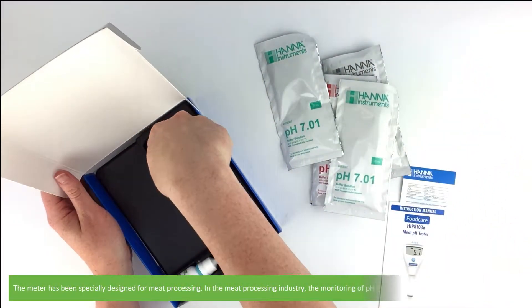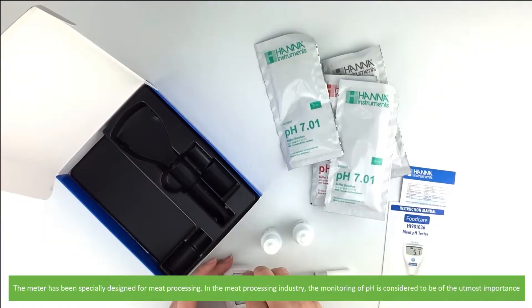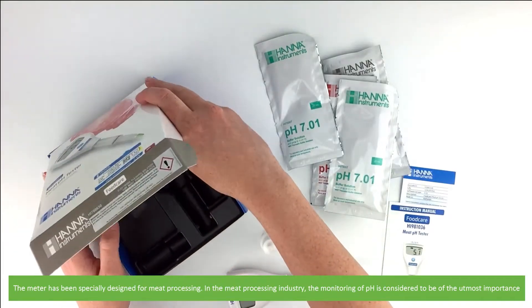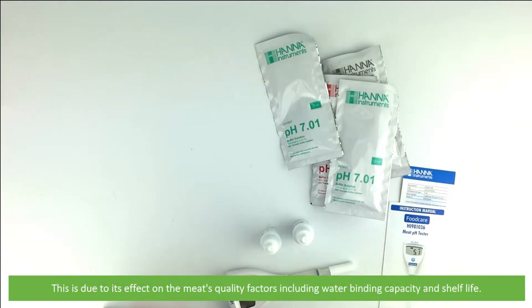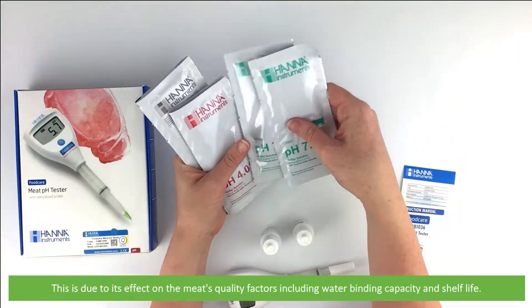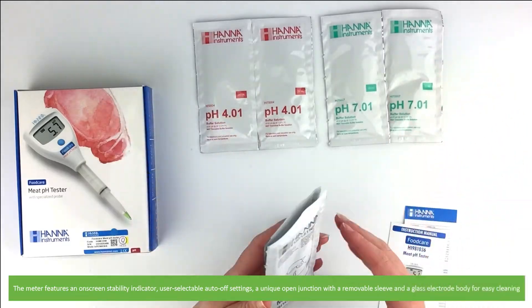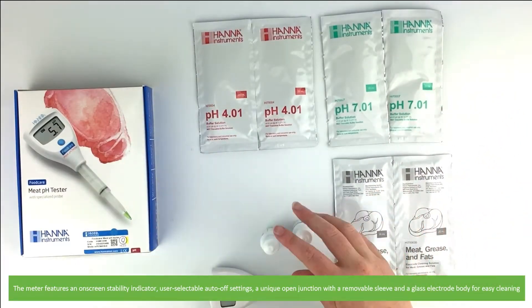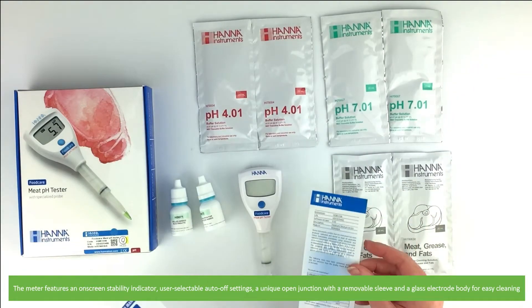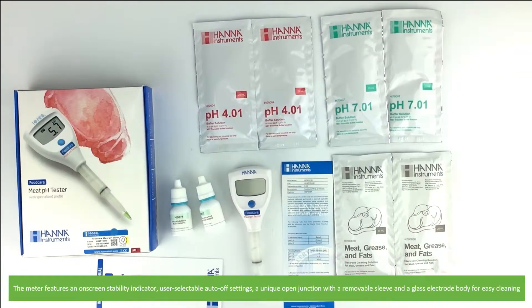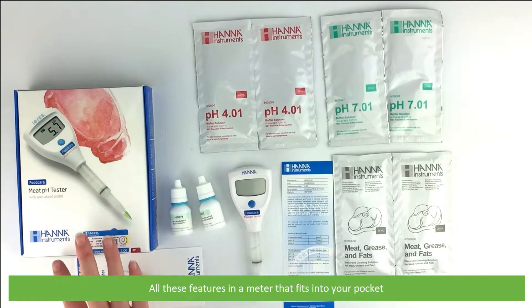The meter has been specifically designed for meat processing. In the meat processing industry, the monitoring of pH is considered to be of the utmost importance. This is due to its effect on the meat's quality factors including water binding capacity and shelf life. The meter features an on-screen stability indicator, user selectable auto-off settings, a unique open junction with a removable sleeve, and a glass electrode body for easy cleaning. All these features in a meter that fits easily into your pocket.